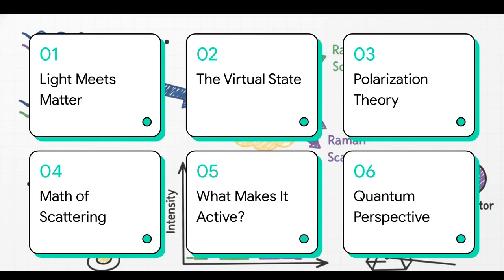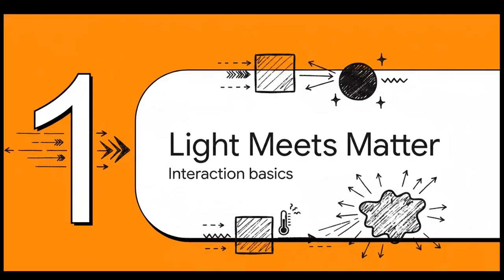From there, we'll break down the mathematics of scattering, figure out what makes it active, and wrap the whole thing up with the quantum perspective. Let's build this up step by step. All right, moving into Section 1, light meets matter.